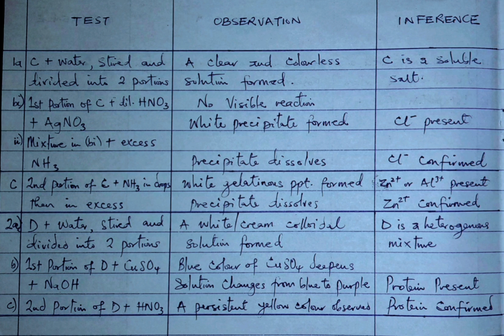The questions in your exam may not cover the whole analysis, but we're doing a full analysis so that wherever the question comes from, you can answer it appropriately. All right, so let's go. Now I made a table of test, observation, and inference of the salts C and D.